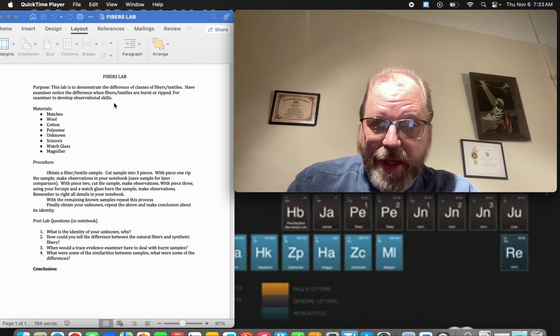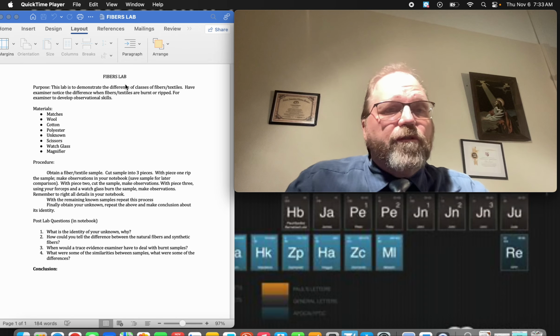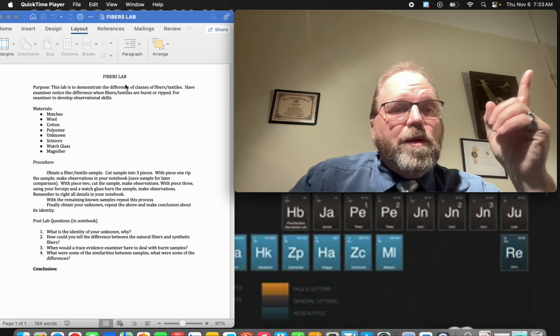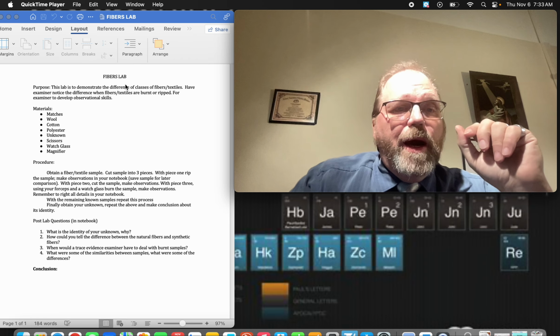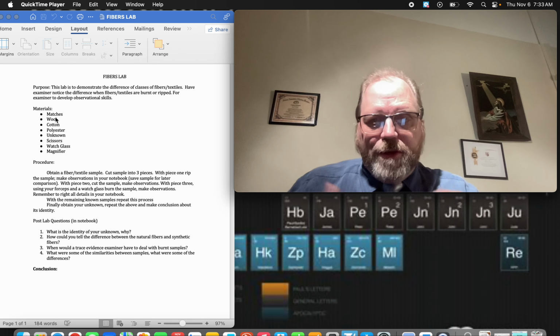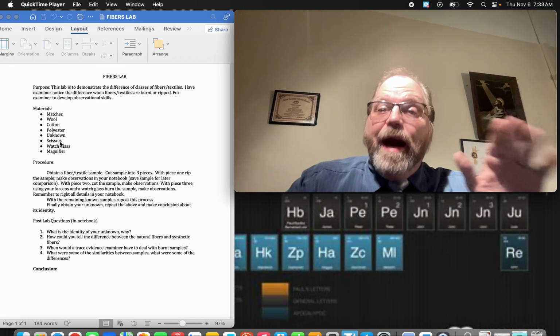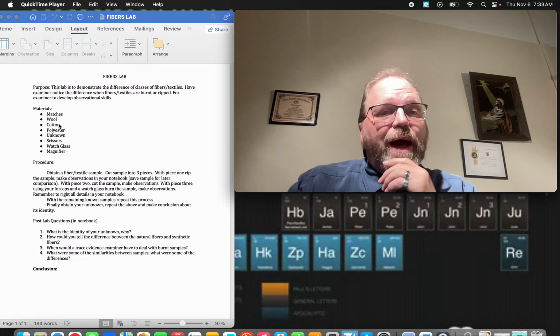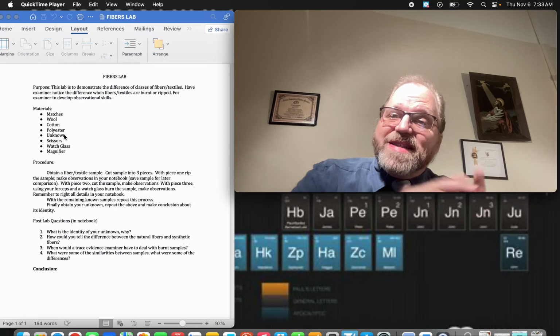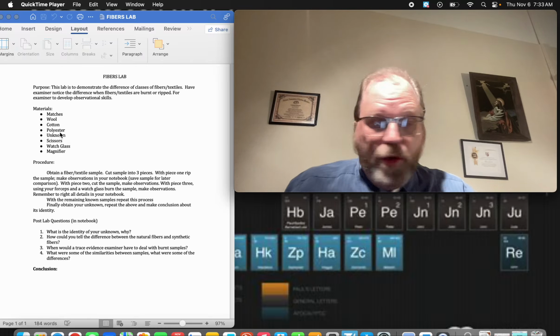We're going to do a lab today on fiber analysis. What you're going to need to do is get for yourself some wool material, cotton material, and polyester, those three. You can go to any fabric store. You don't need much. And then get an unknown. So you'll have somebody pick up one that's either wool, cotton, or polyester, and make sure it looks different than the samples that you're going to take.